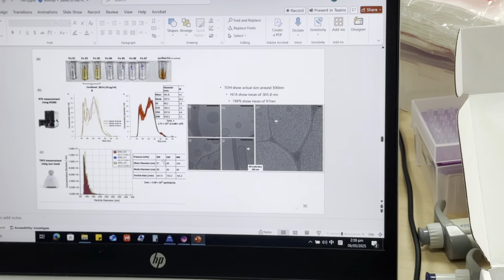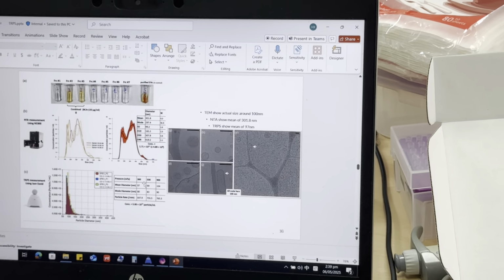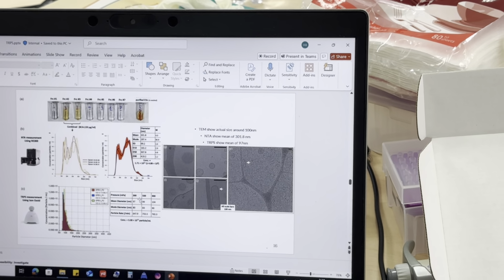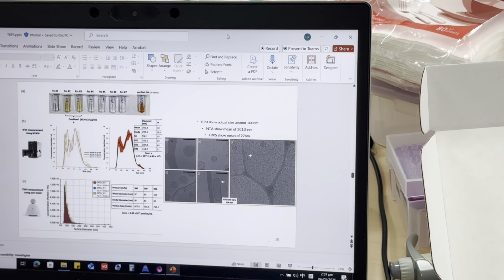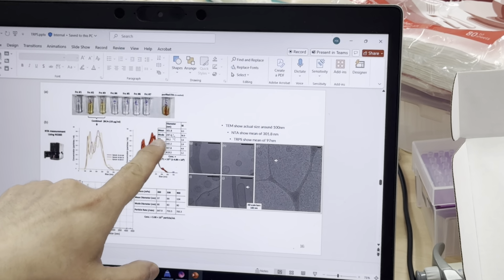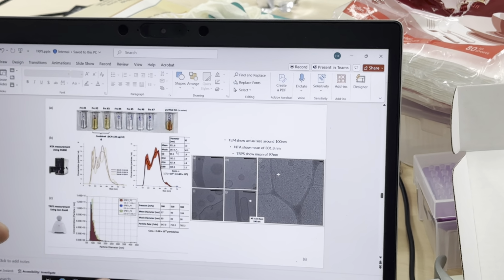As I talked about in the morning, usually when preparing in vivo or injection samples, you need to do sterile filtration. For example, we know that 0.22 filters can be used to do sterile filtration, right? But if you get 300 nanometers, and you trust this data, you cannot use the 0.22 filter. You will lose most of the samples.